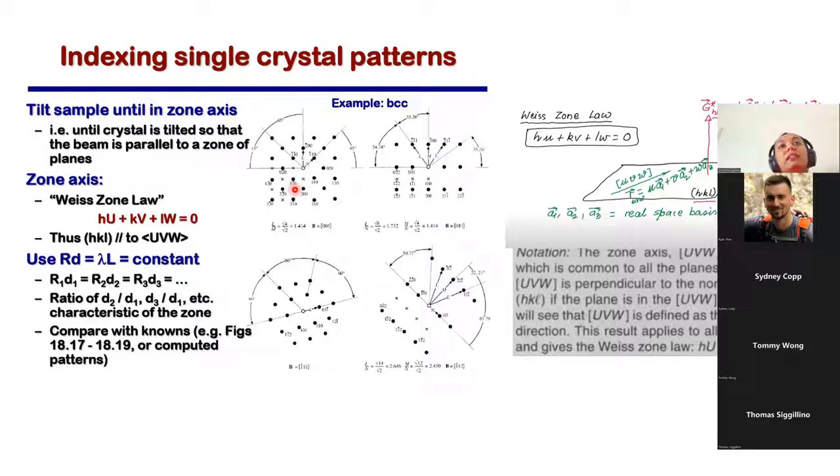And these are the example of the BCC zone axis. Now this is a zone axis which is 001. And in literature, your zone axes are very clear. Which one of them is 001? So the 001 zone axis looks like this. You have to just join points around this central point. Do not join across any other point because then it would give you a different shape. So join across the central point to see what the shape is like. Here I see a very clear shape, a rectangle is present. I would join it for you so that it's easy. So this is the zone axis here.